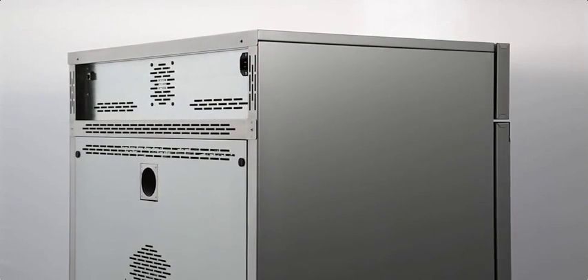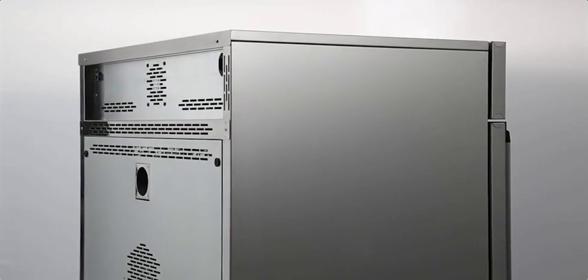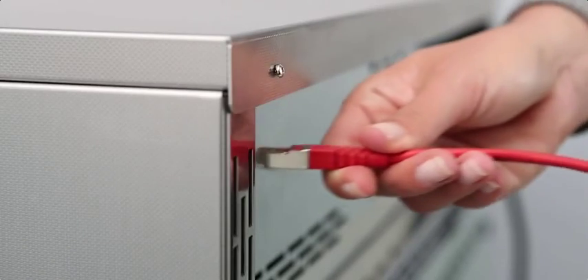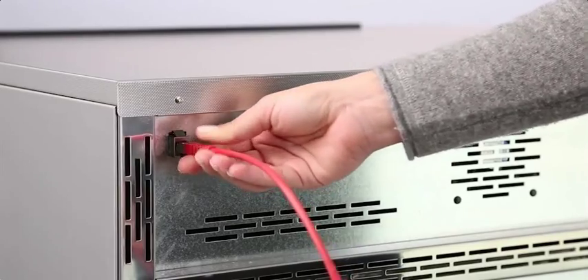We think that the programming of an oven should be possible from anywhere in the world without problems. For this reason, our Generation 2012 appliances feature state-of-the-art communication interfaces. Ready, steady — and your ethernet connection is all set.